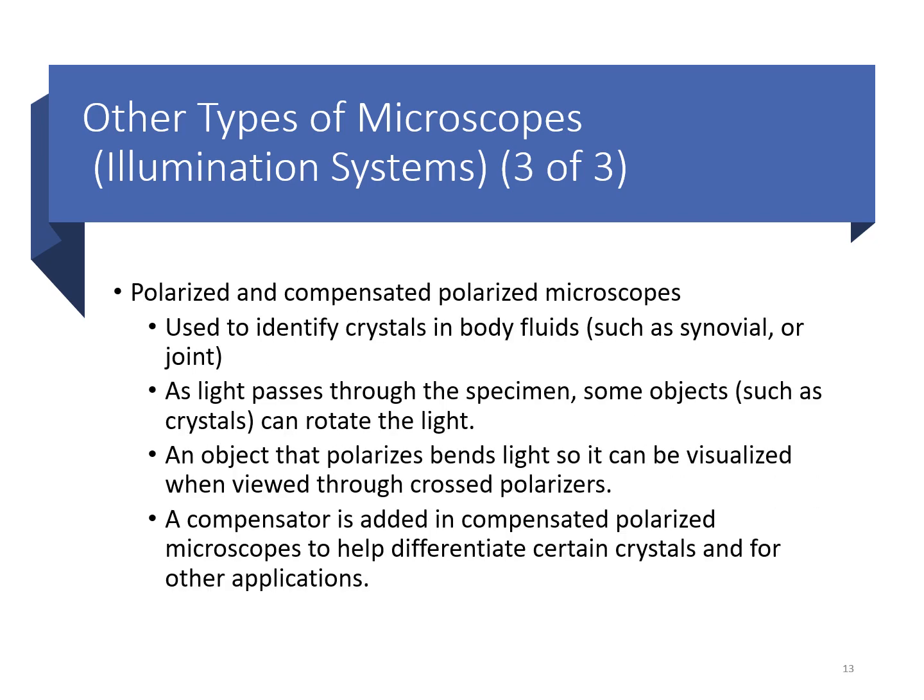There are also polarized microscopes. Now, polarized microscopes are actually kind of fun. We use these to look more specifically at crystals in body fluids. When you look at the crystals, depending on how the light path passes through that crystal, the color that the crystal illuminates based on those light fields, and the direction that the crystal is lying, it helps you identify the particular crystal.